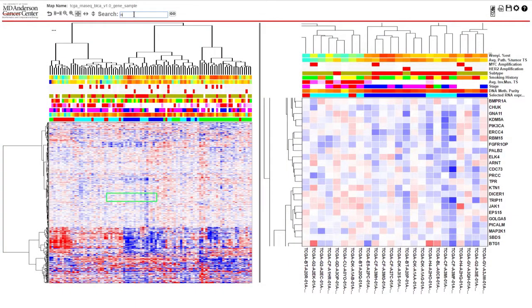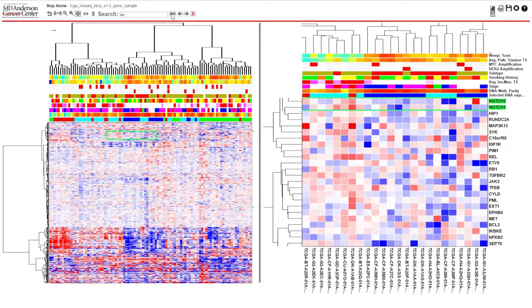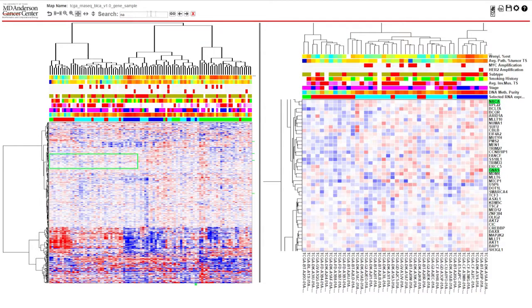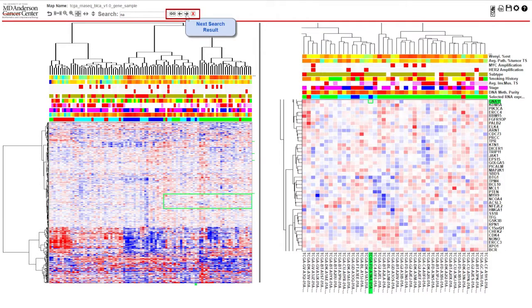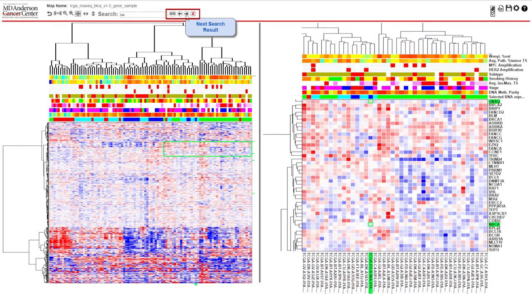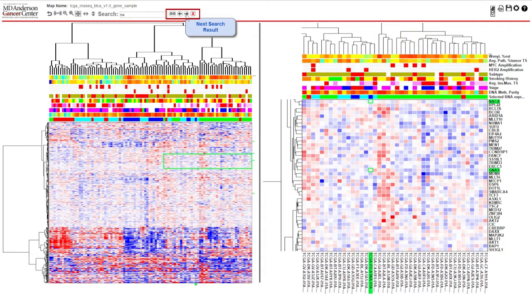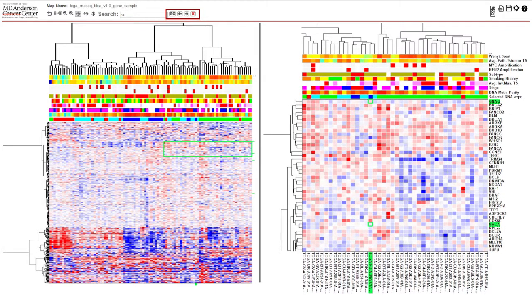If your search box remains white, that means all of your search terms have returned a match. You can scroll through the search results using the arrows on the right side of the search bar. You can clear all highlighted terms by clicking the X button.